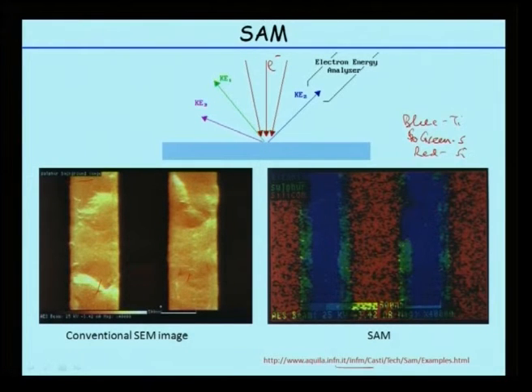As you can see here, sulfur is green, and in the AES scanning Auger microscopy, you can see these red regions are coming from silicon. These are all silicon: these three regions, silicon, silicon, silicon, and then you have sulfur and titanium sitting. The blue here, which is much smaller, is titanium, and green is sulfur.